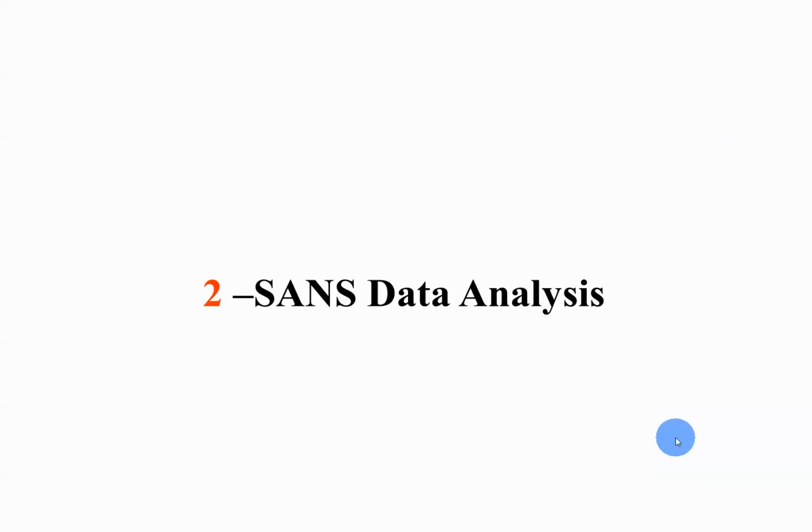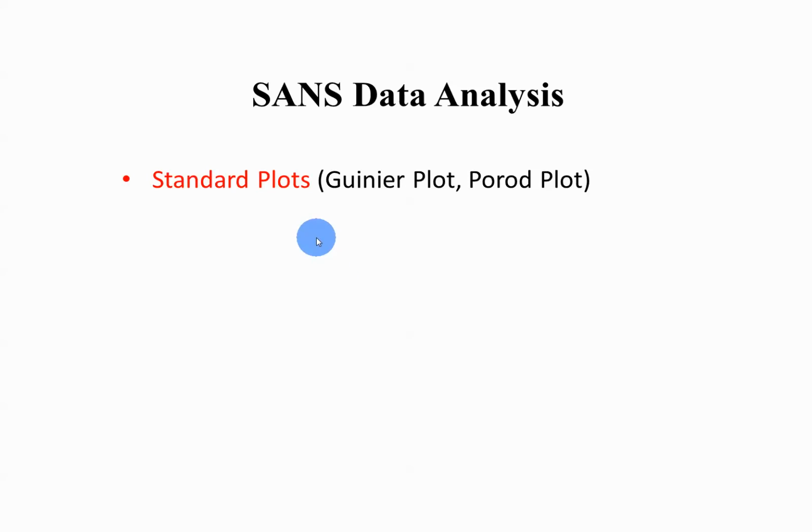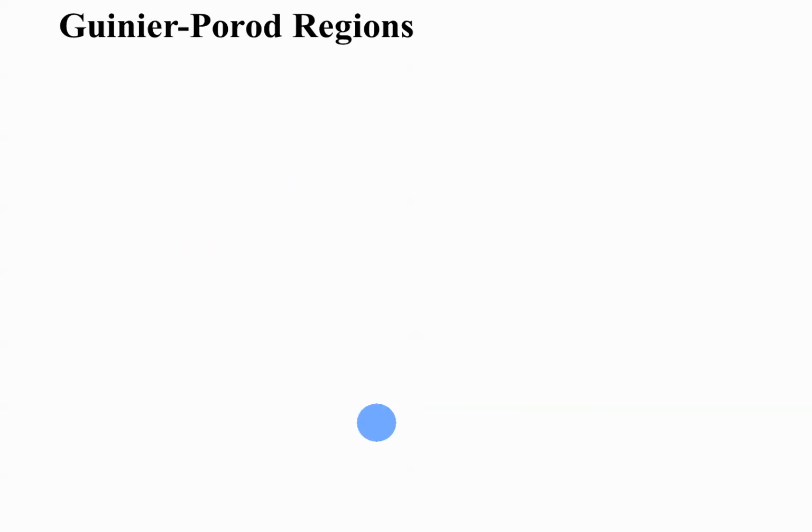1 particle. SANS data analysis, standard plots. I'll cover the Guinier plot and Porod plot, SANS models. We have over 100 models that we have developed in our SANS data analysis package, inverse Fourier transform, shape reconstruction. Just one slide for these two.